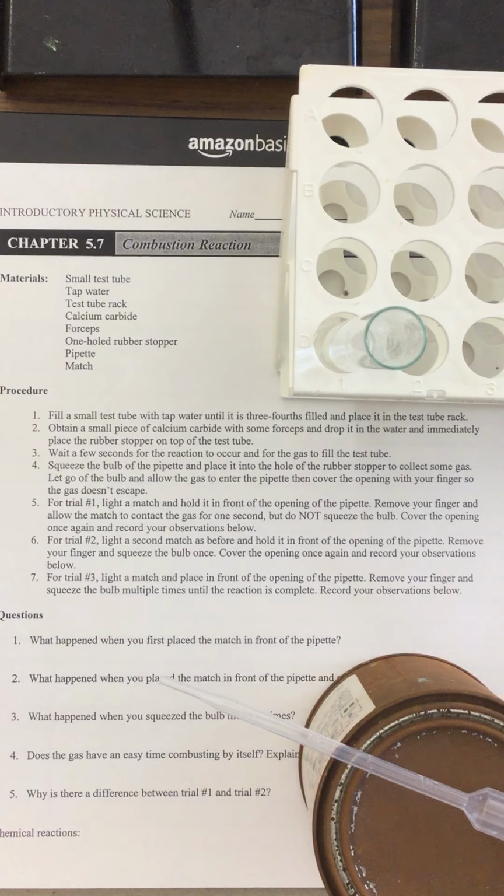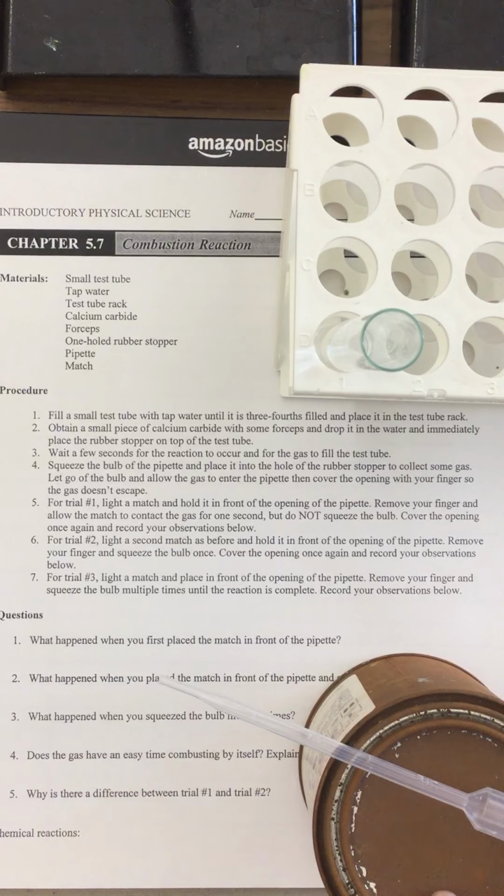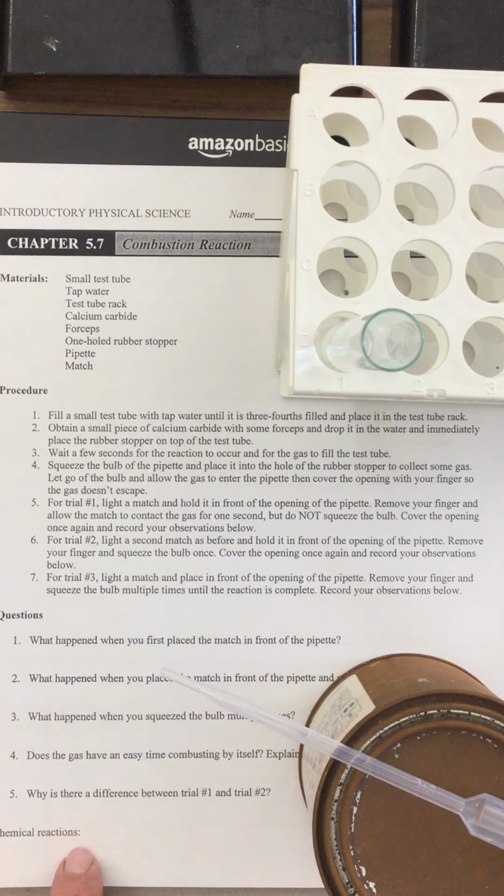Unfortunately, you guys aren't going to be here for the combustion reaction because in a combustion reaction, something's going to explode. So that's what we're going to be looking at. And I currently have a test tube that's just filled with some water. And I'm going to be combining this substance with the water, and it's going to be producing a gas. We'll go over the chemical reactions at the very, very end. We'll also go over these questions as well, and we'll record all those observations at the end of the experiment.